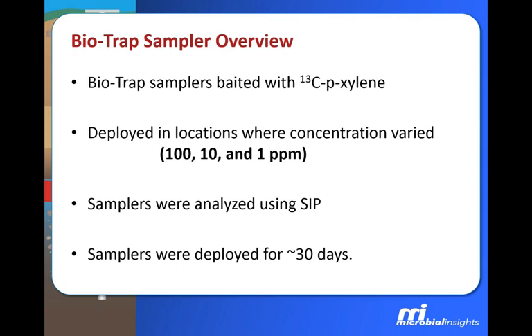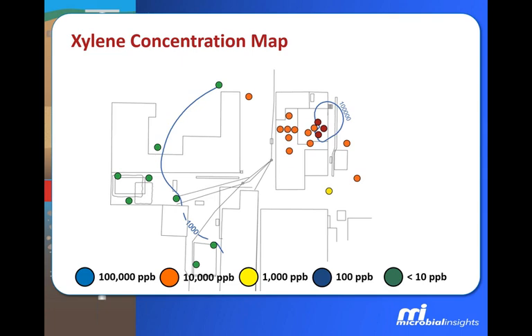So in assessing the degradation of naphthalene at the site, particularly M&A, the chemical analysis does show some decreasing contaminant concentrations. That's a green light. The stable isotope probing definitely shows that naphthalene biodegradation is going on. That's a green light. And then there are multiple genes from both the anaerobic side and the aerobic side known to be involved in the degradation of polyaromatic hydrocarbons also detected. So we've got green lights all the way across the board indicating that naphthalene biodegradation is definitely going on.